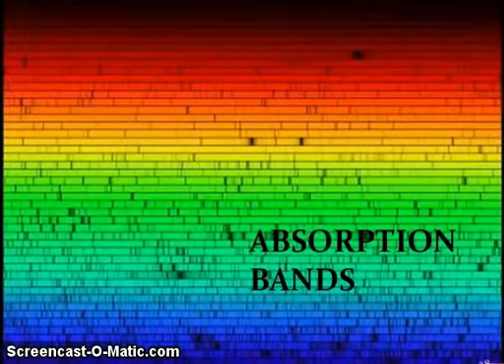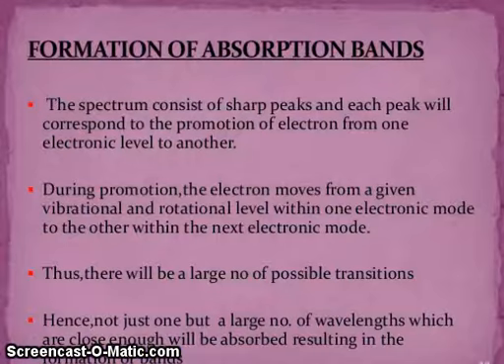So absorption bands. Formation of absorption bands. The spectrum consists of sharp peaks and each peak corresponds to the promotion of an electron from one energy level to another. During the promotion, the electrons move from a given vibrational and rotational level within one electronic level to another within the next electronic level. Thus there will be a large number of possible transitions, meaning not just one but a large number of close wavelengths will be absorbed, resulting in the formation of a band.